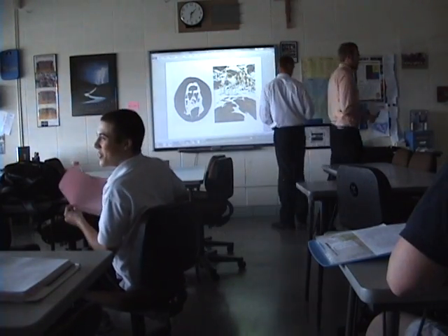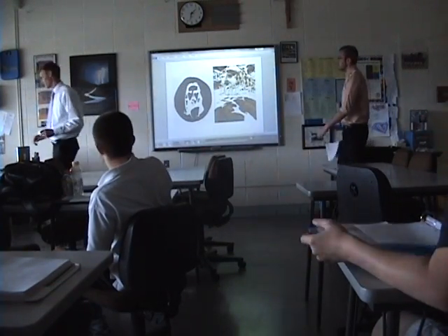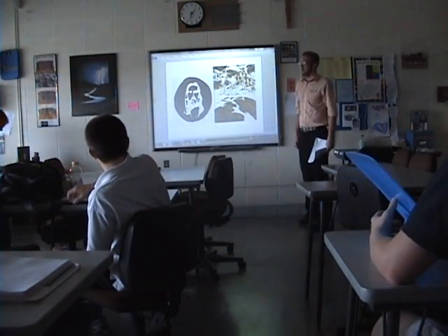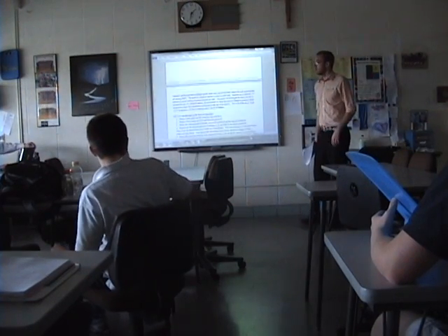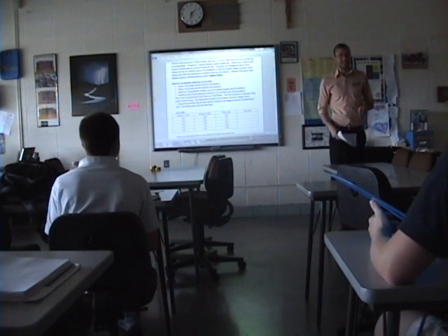All right, so in lab today, we're going to talk about 2 of these 6 factors that affect the rate of a reaction. You guys have it in your packet, page 2. So the first factor that we're going to look at is concentration.